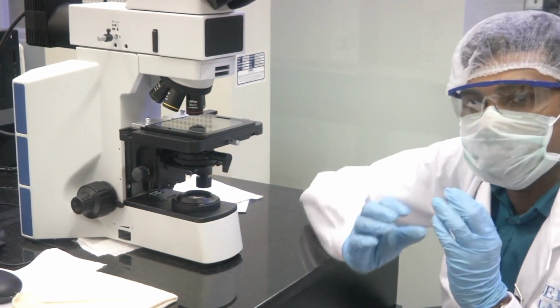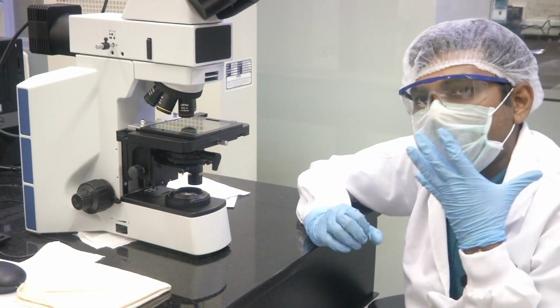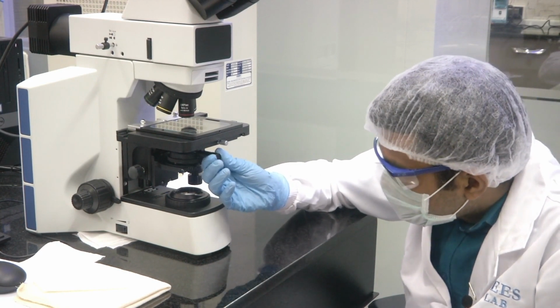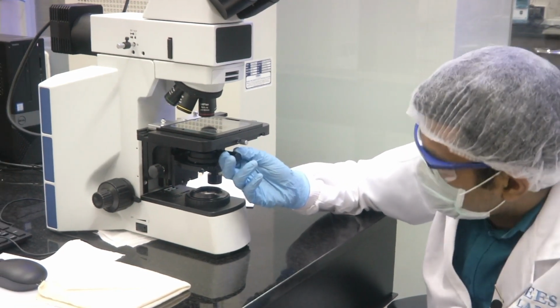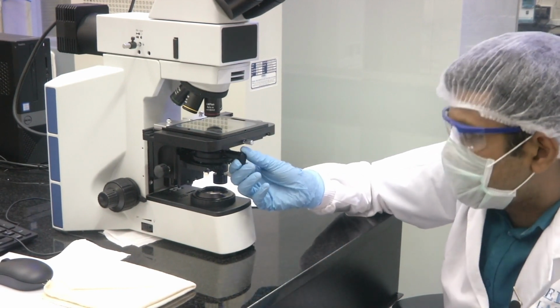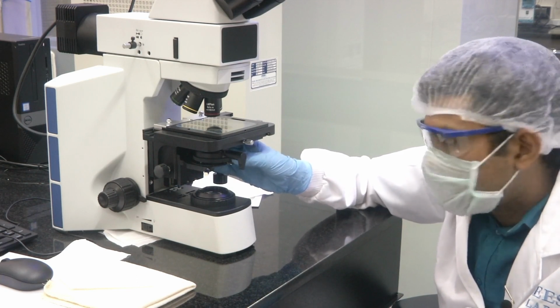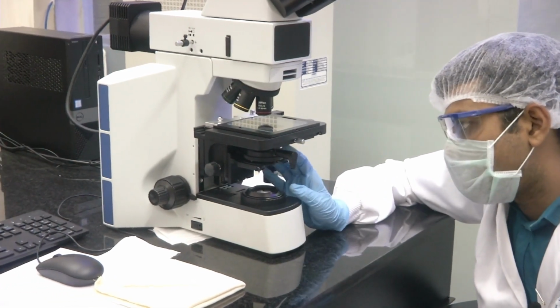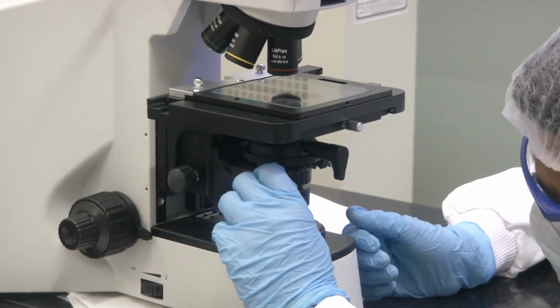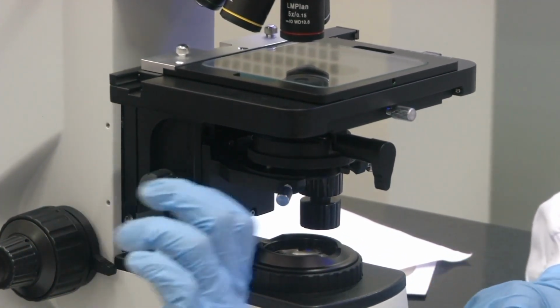So what is aperture? Aperture refers to the diameter of the optical light collecting mechanism. There is a knob here below with which you can adjust the aperture of your objective that collects the light. You can also adjust contrast through a phase ring that is provided below. So you can adjust the contrast and work with it. There are a lot of options provided on the microscope like this, and over time when you use it, you will get to know the exact utility of each of these options.